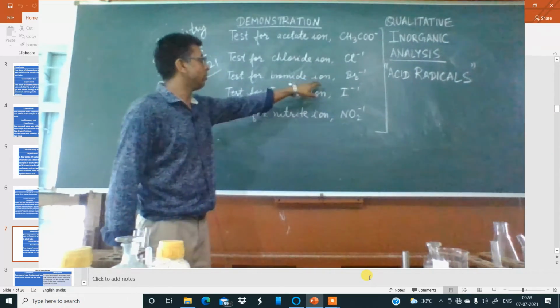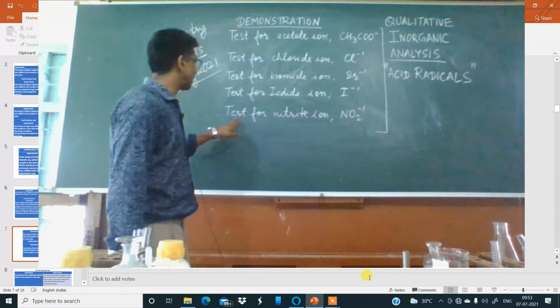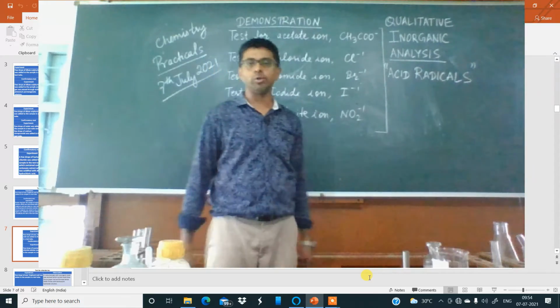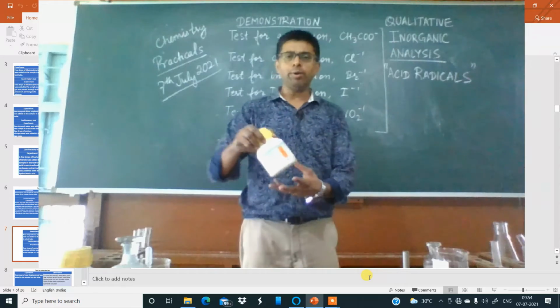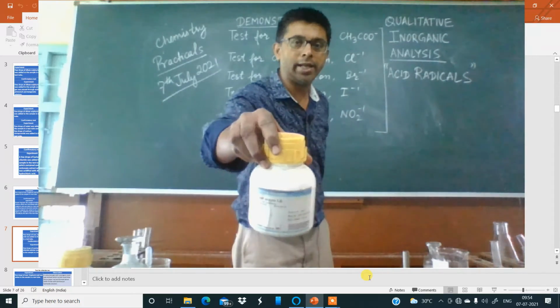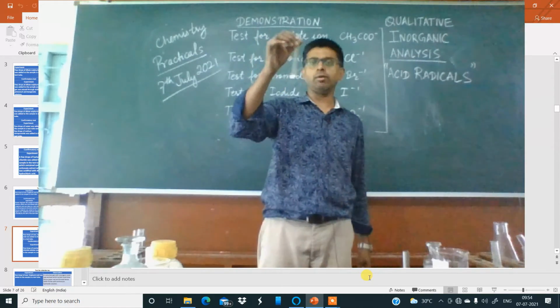This is test for bromide ion, Br-1, test for iodide ion, I-1, test for nitrite ion, NO2-1. This comes under qualitative inorganic analysis of acid radicals. So the first test which I was supposed to show you was test for acetate ion, CH3COO-1. The sample which I had taken to test acetate ion was lead acetate, (CH3COO)2Pb. This sample was beforehand taken in a test tube.